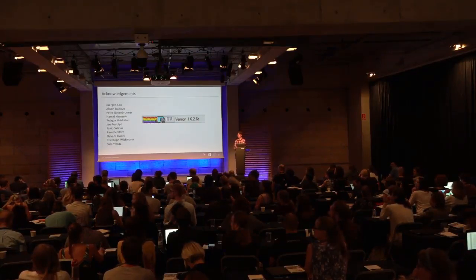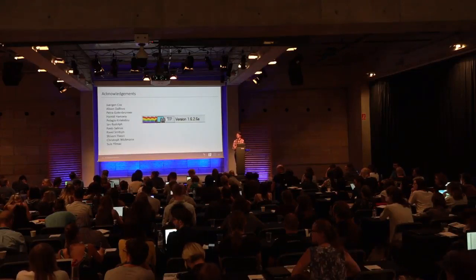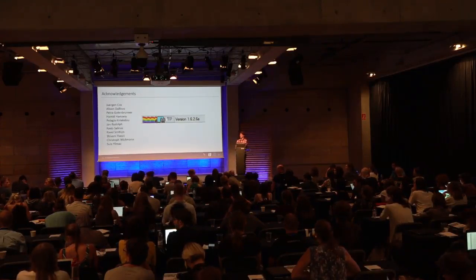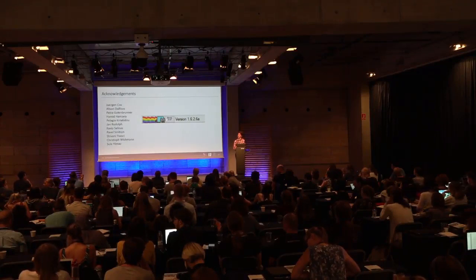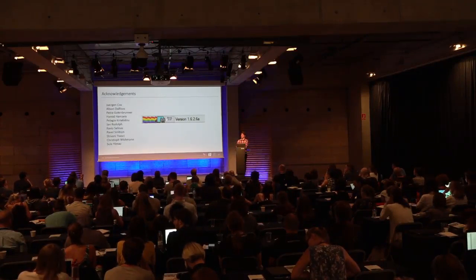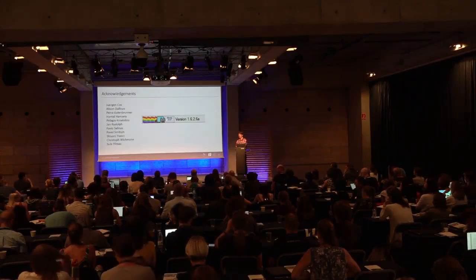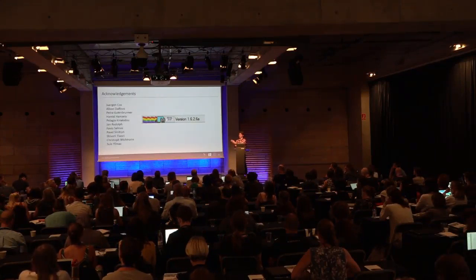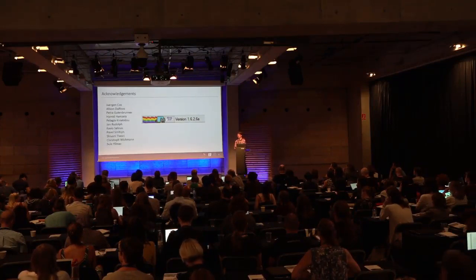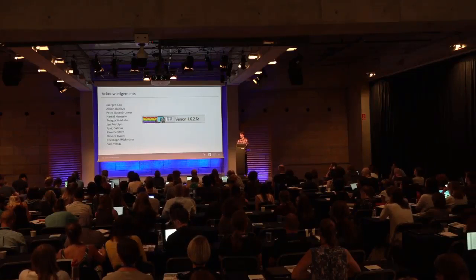Thank you for the nice talk. I have two questions. One is, in the deep proteome analysis, you were showing that there are 10,000 sites for phospho and 7,000 for N-acetylation. Would you recommend to always run phospho identification in a regular search? If you've done really deep proteomics and you're interested in the quantification of those sites, it's definitely worth turning on. You could also do a dependent peptide search, maybe on one of the replicates. So if you have 10 replicates with 8 high pH fractions, maybe you could take one of them and do a dependent peptide search. By that, you would know which modifications to turn on in the variable modification search.